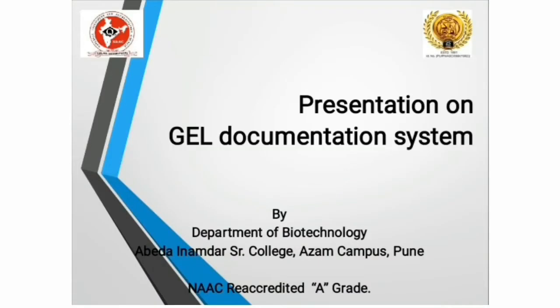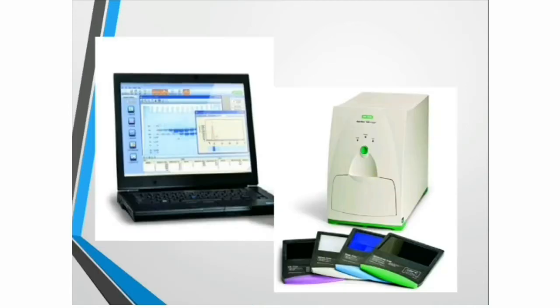Presentation on gel documentation system. This is the gel documentation system. It consists of an imager and the software.